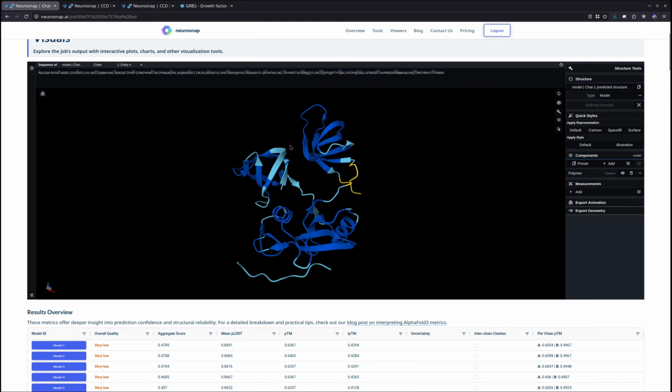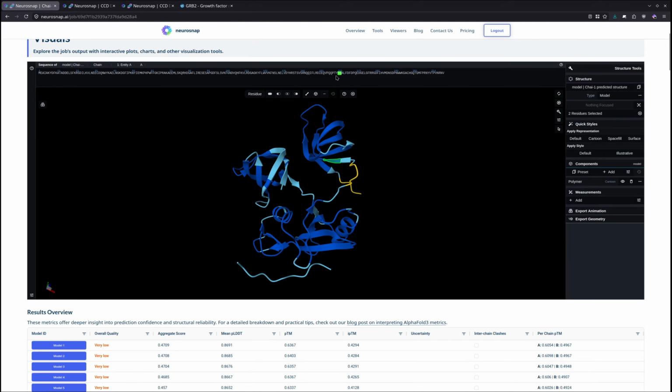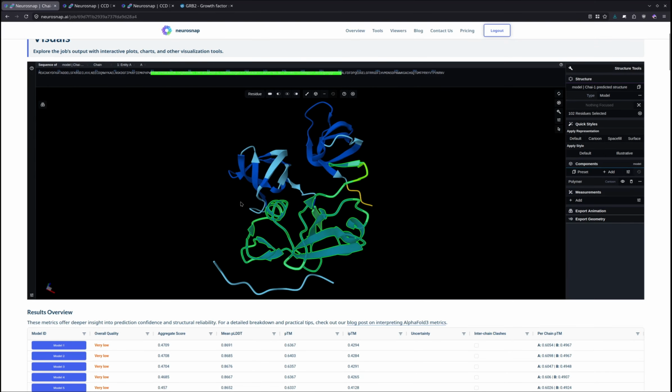It seems to be binding in the right region, as if I remember correctly, the region it should be targeting is roughly 60 to 160, which is the SH2 domain. And what we can do actually is highlight that a little bit better. So 60 is more or less around here, and 160 is, oops, let me redo that. Letters are a bit small. Right over here. Actually, that's a little bit too much. We can remove some of those, and we can remove some of these.